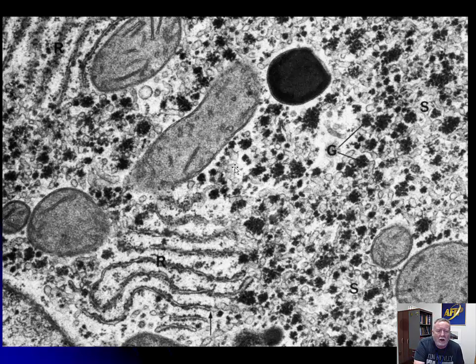These aggregates are known as alpha particles of glycogen. Glycogen comes mostly in alpha particles. It's sort of bundled up. There's also beta particles which are individualized, which could just as easily be ribosomes to my eye. Maybe here's one here, here's some here. We're up near some rough endoplasmic reticulum. So I think without the alpha particles or the glycogen aggregates, it's really tough.